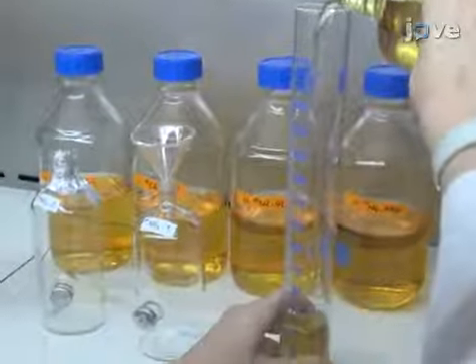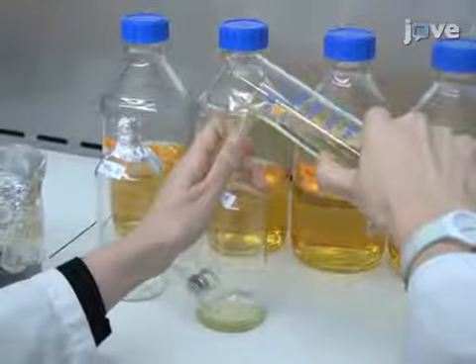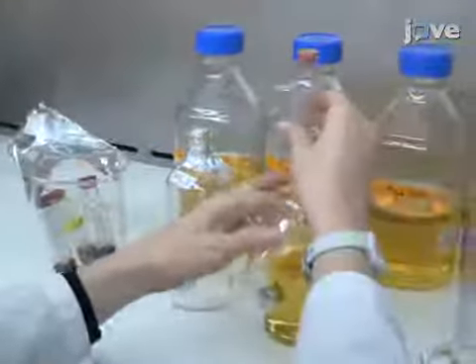Using a sterile measuring cylinder, divide the medium between 2 pre-sterilized fermenters that contain a magnetic stir bar and are equipped with fermentation locks to avoid the entry of oxygen but allow the release of carbon dioxide.